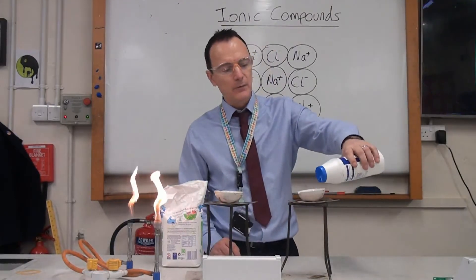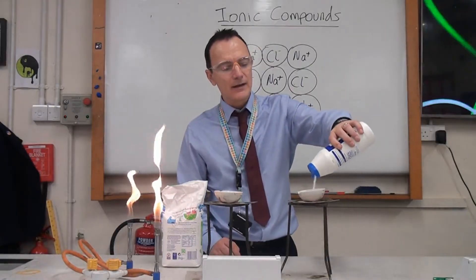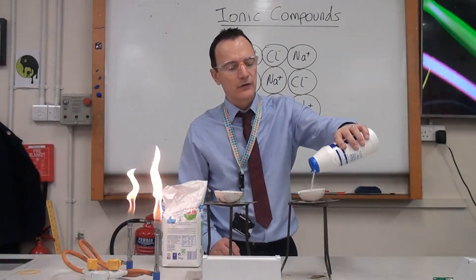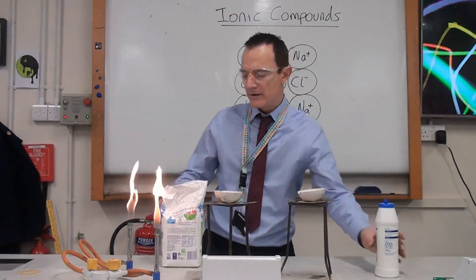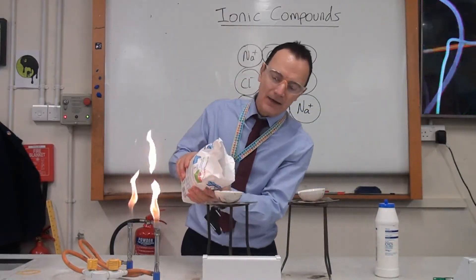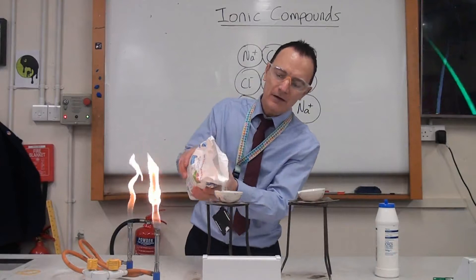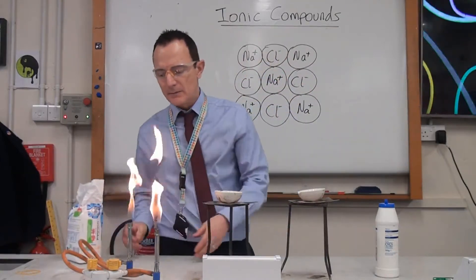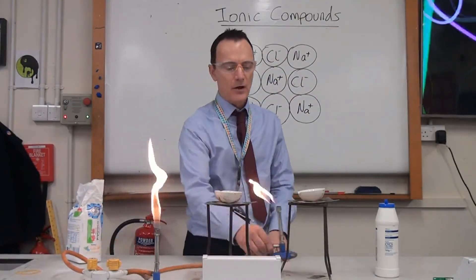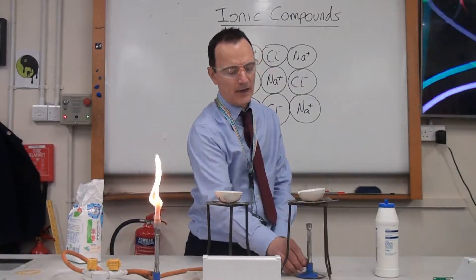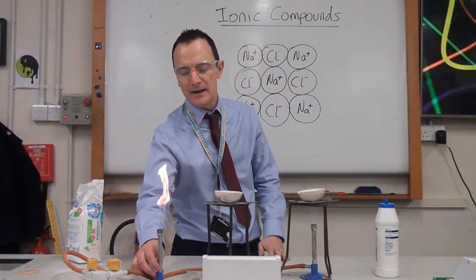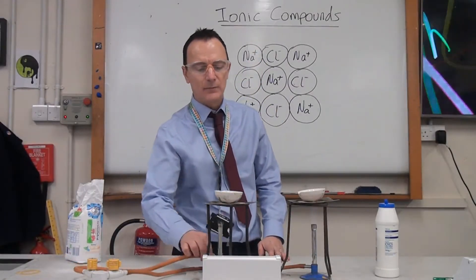And I'm going to put some of this ionic salt, the sodium chloride, in one evaporating dish. And I'm going to compare that to something that looks very similar, which is sugar. And I'm going to see what happens to the two when I start to heat them up. And we're going to come back to that in a few minutes and see if there's much of a difference.